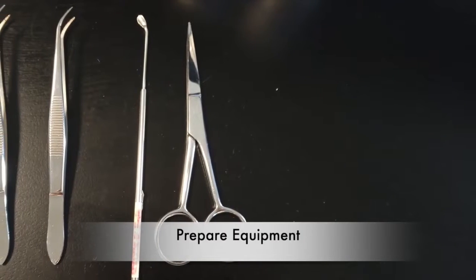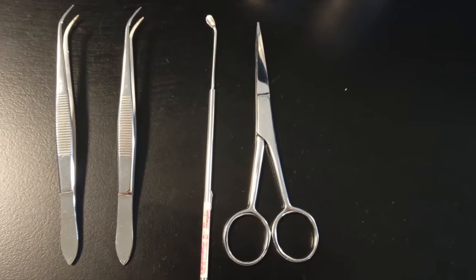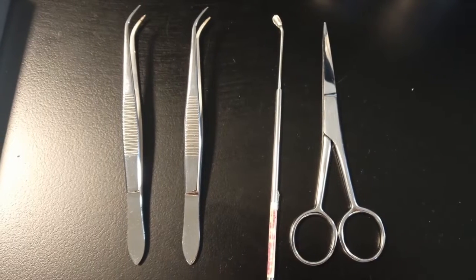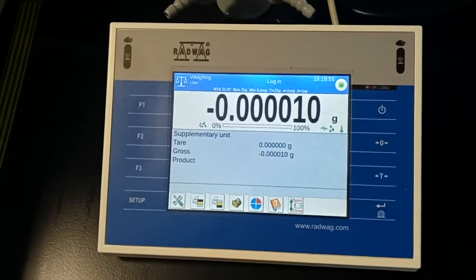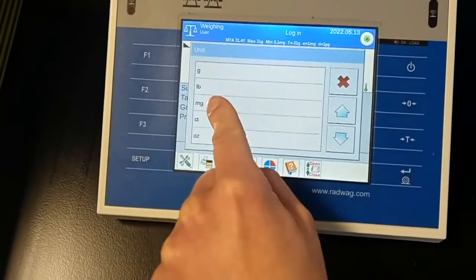Lay out any of the equipment that you're going to need and set the units of your balance. We're using milligrams since our target weight for most of our samples is going to be 2 milligrams, with an acceptable weight of between 1.9 and 2.1 milligrams.